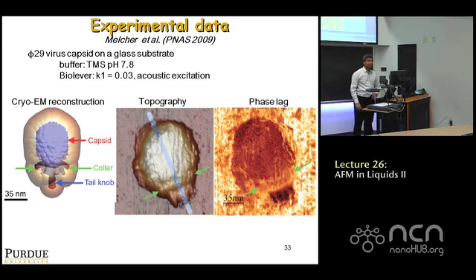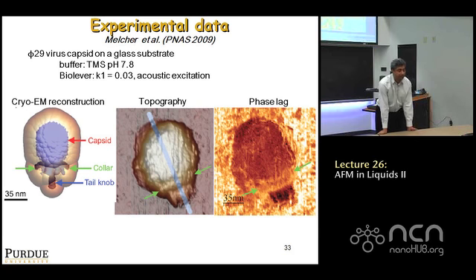Yeah. Yeah. There is a lot of understanding for liquid base. I haven't actually talked about air-liquid interface yet. Yeah, but what I'm saying is, let's say the air has certain humidity. Is it possible to adapt some humidity control in the air so then you can make it quite dry? Yeah, no, absolutely.